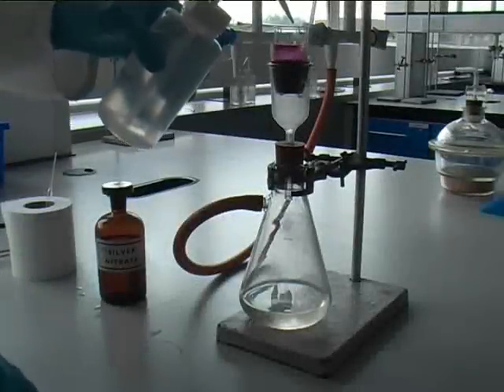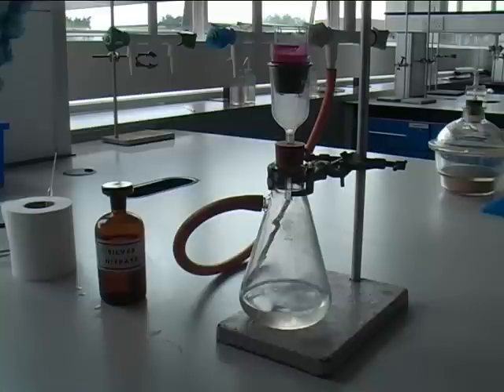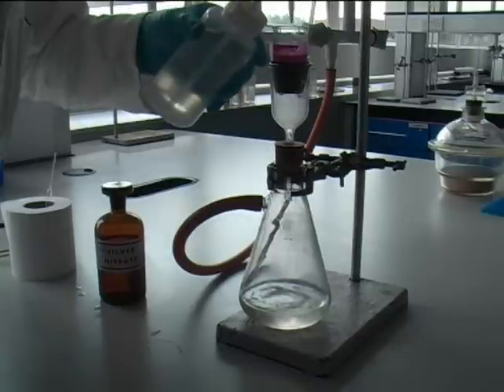Finally, wash the complex with deionised water until all the chloride has been removed. It is important to do this as the chloride will add unwanted weight to the complex. The test for chloride ion can be found in the qualitative version of Vogel.